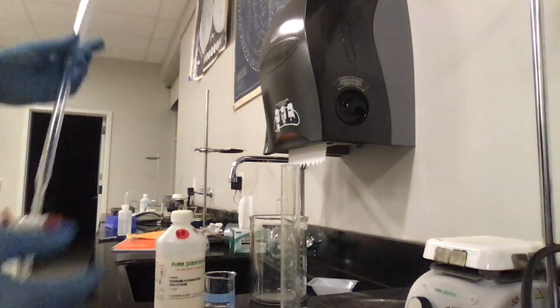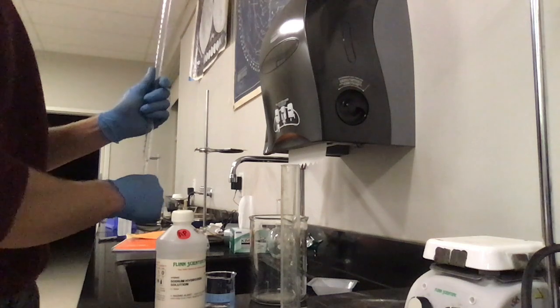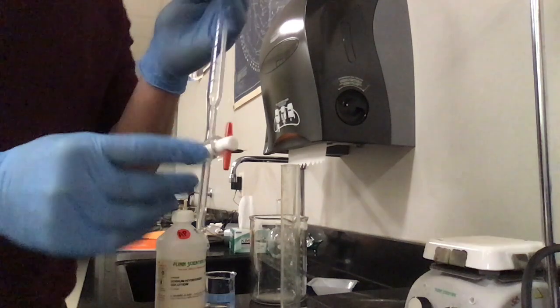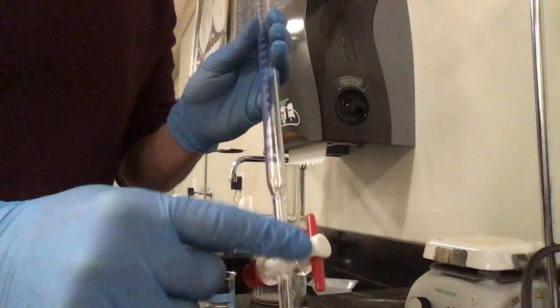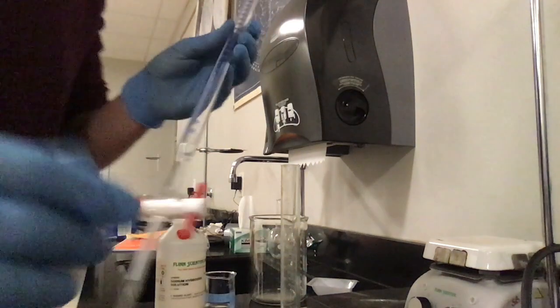Before I do that, I have to do something called seasoning my burette. And to do that, what I'm going to do, I'll talk about the parts really, really quickly. Here's the stopcock. Here's the shaft. That's the two parts of the burette.